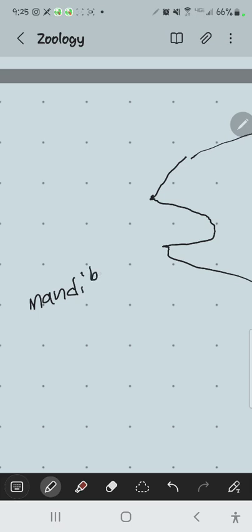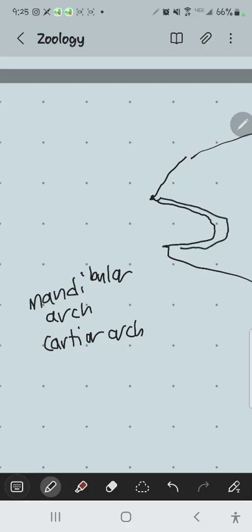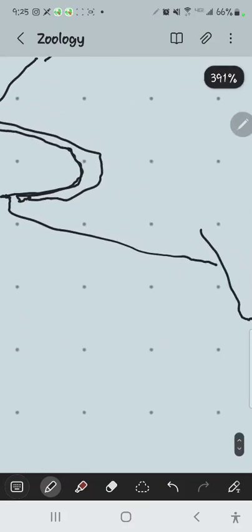And the cartilage is so flexible, and you're going to see that when you check out the sharks today, that you can easily slice through it with a scalpel or cut through it with scissors. Cartilage is a really flexible, kind of soft material. So when this mandible arch was fresh, when it was taken out of the shark that was killed, you could actually fold it in half and kind of twist it. It's not really a rigid thing. So by itself, this is not a very good chomper.